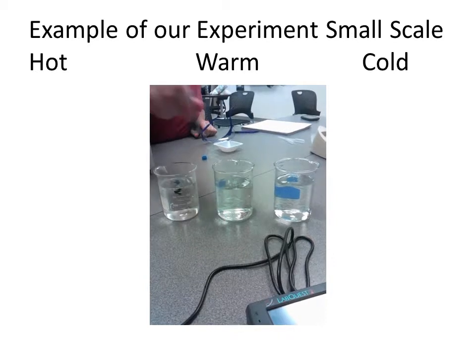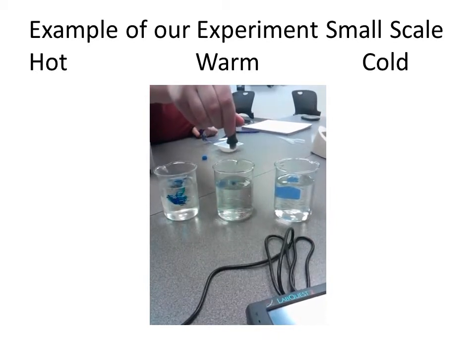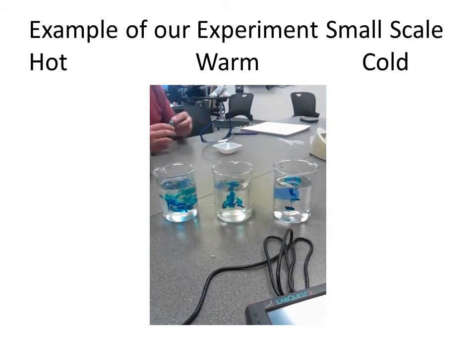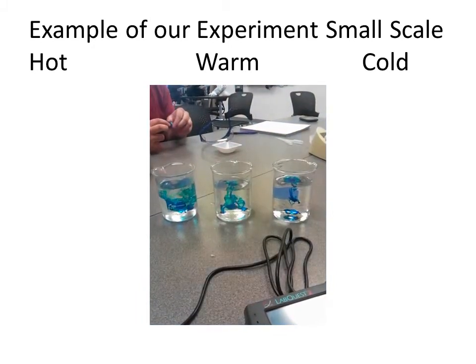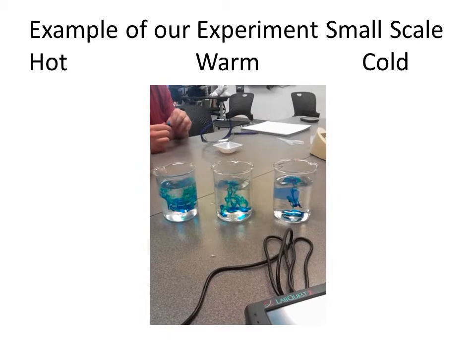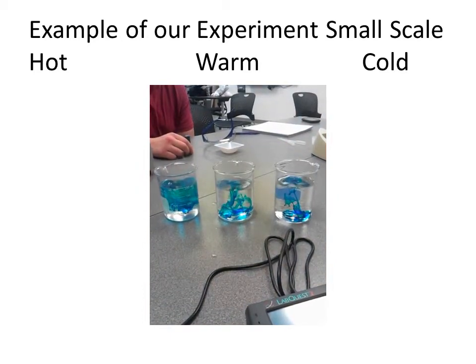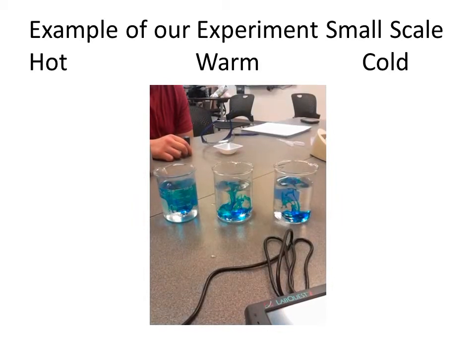I think we want to do them at the same time because we'll see how they disperse across the... What are you wanting to do? Just to see how a heated substance goes, the rate goes faster. So that's why we put them in at the same time.